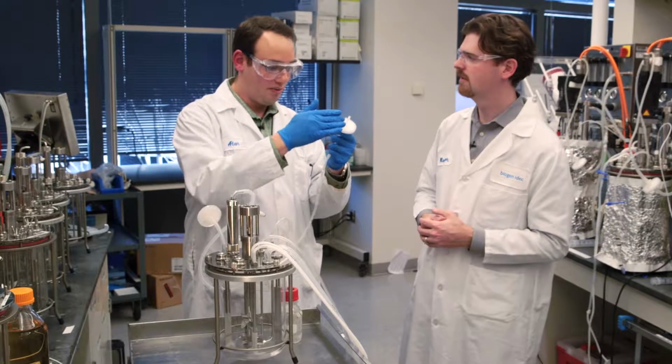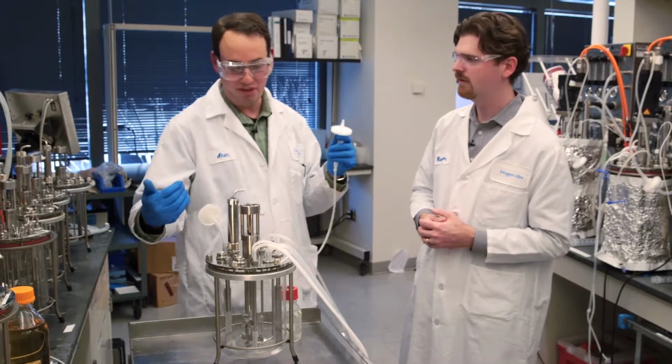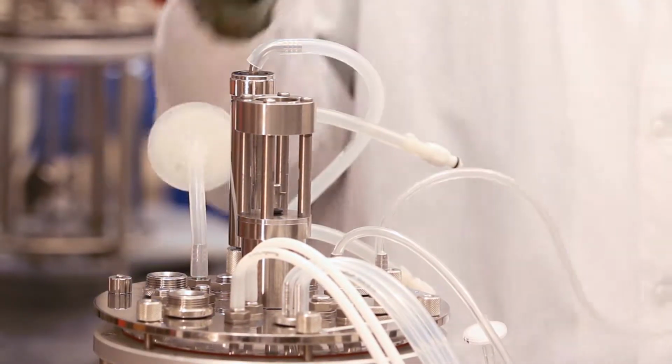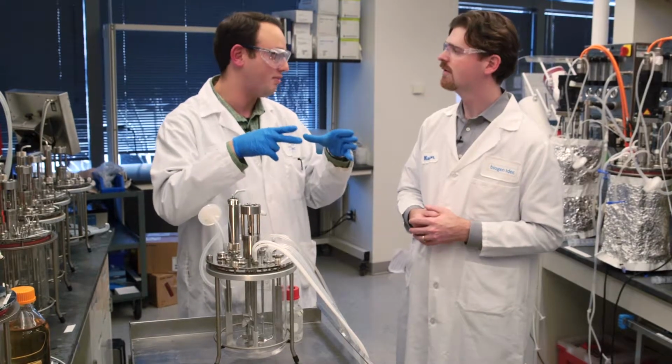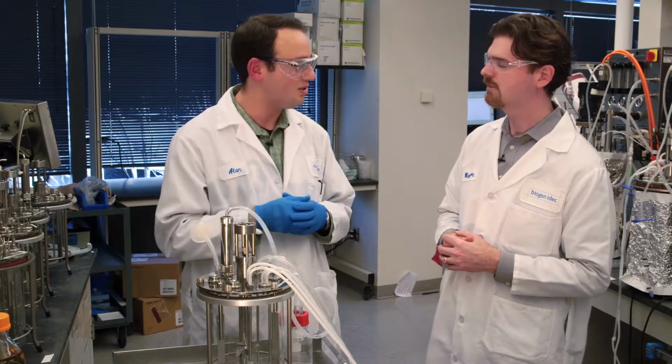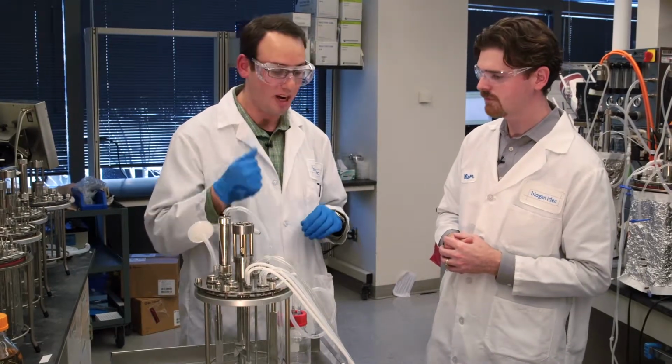We have two main filters for delivering oxygen, one through the bottom down to the sparger, and one through the top. This is what we call our overlay. So this actually lets us gas exchange across the surface area of the top of the culture. So that's also part of the computational fluid dynamics and our ability to deliver oxygen and to strip carbon dioxide.